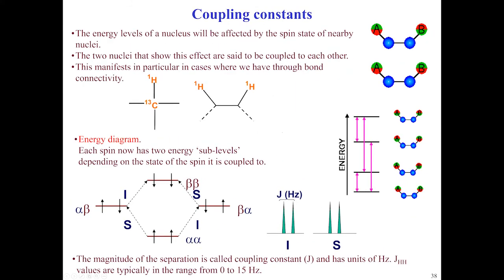So we talked about chemical shift as one interaction. The other very important interaction is scalar coupling, J coupling. So we take a little example like this. Two carbons and two protons, and they of course feel the magnetic field B0, but they also feel that their partner along these three bonds might have a different orientation. And that creates a little, let's say, disturbance. Physicists would say second order effect. So the signal in the spectrum will not be a single signal, but will be a doublet.